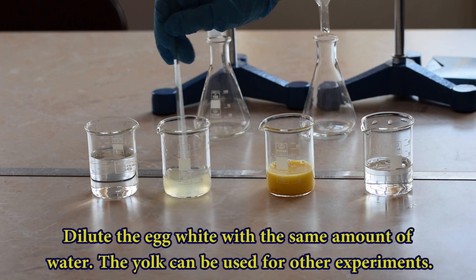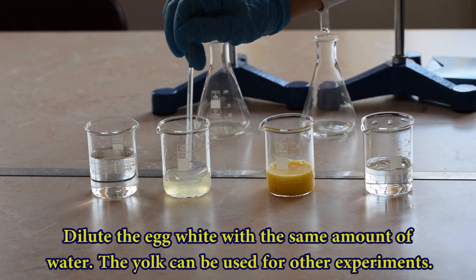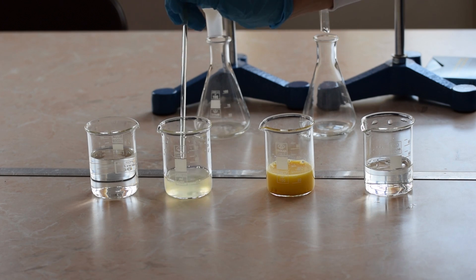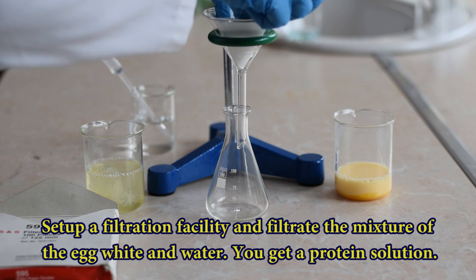Dilute an egg white with the same amount of distilled water. Stir the mixture and filtrate it in order to get a clear solution.